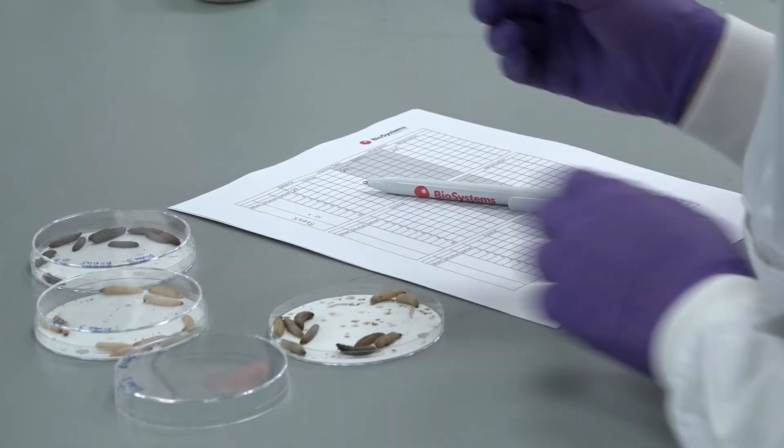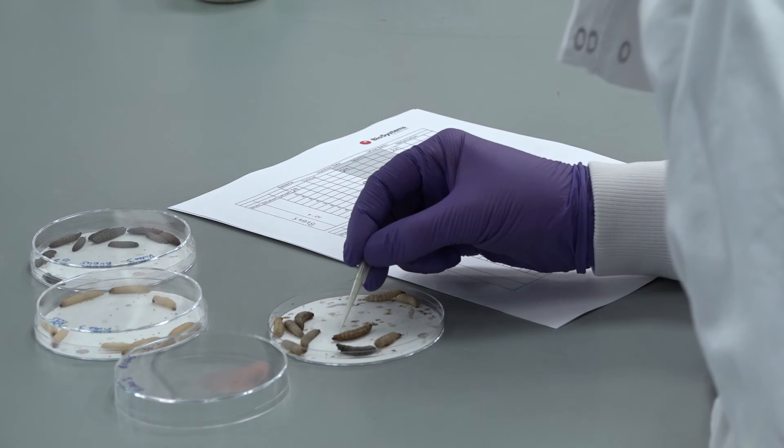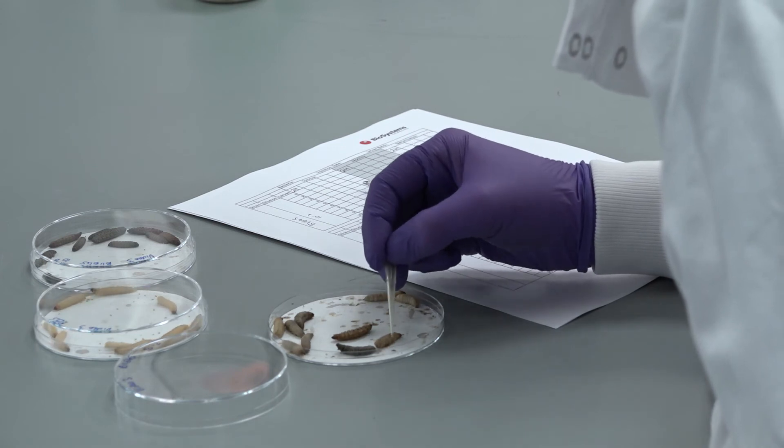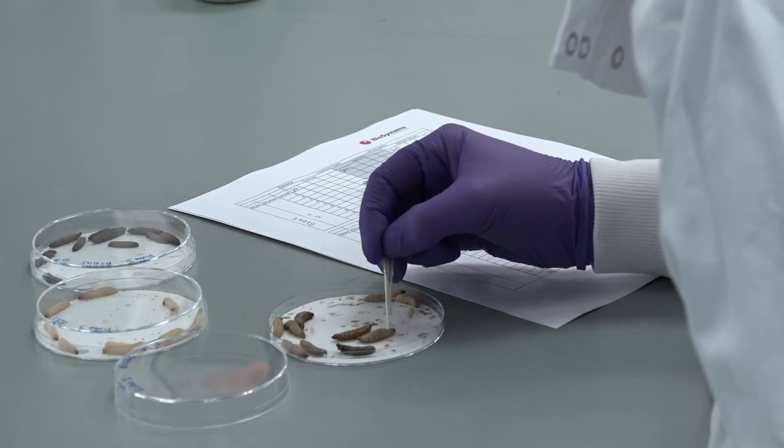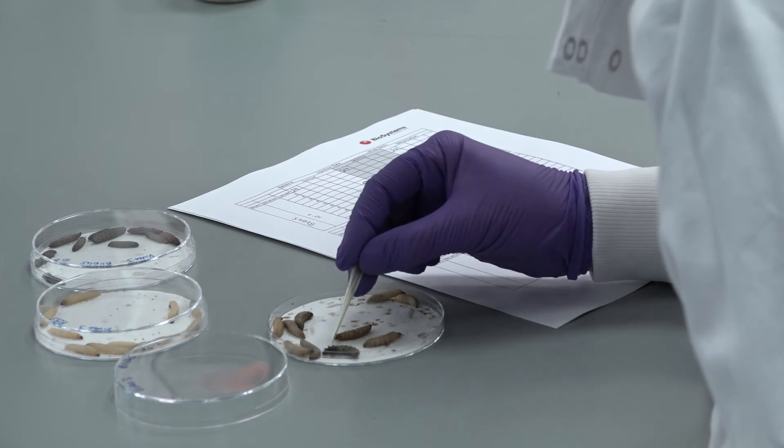When scoring larvae, melanisation, movement and death can be used as endpoints. Death is defined by no movement. We assess this by rolling the larvae and checking for movement.